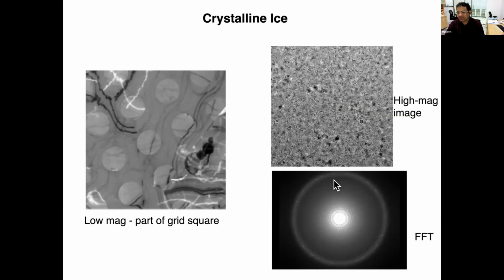So this also tells you that your microscope is working well, there is no drift, the resolution is good. So even if your sample is bad, if you get some ice like this and if you get images like this, then you know that everything is working fine.